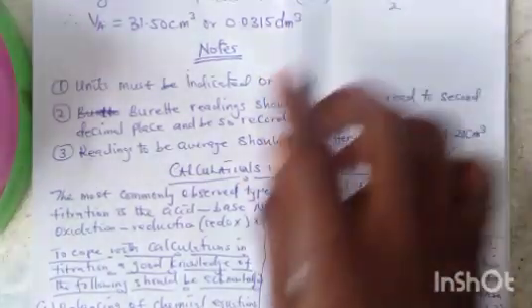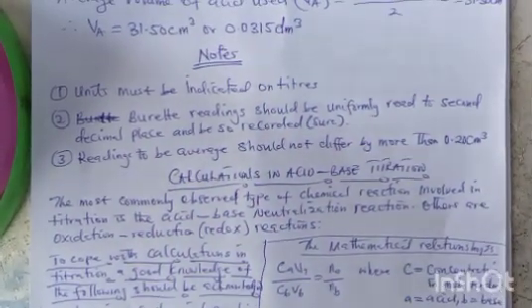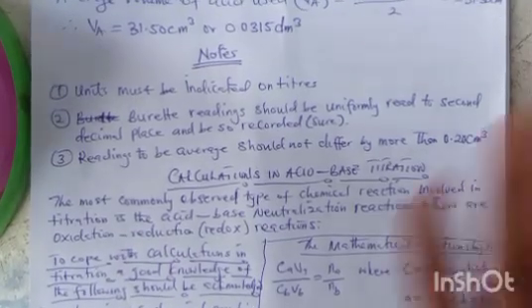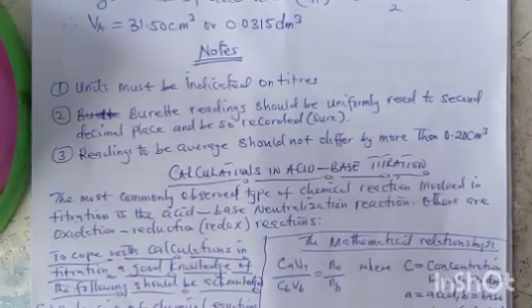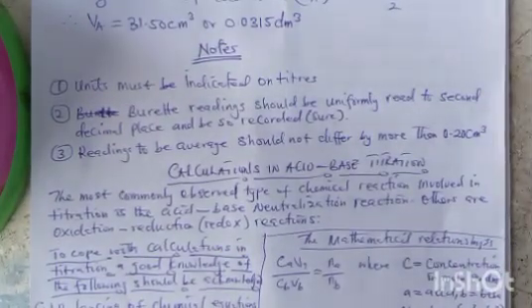So when you watch this reading, everything I'm doing is to two decimal places. You can extend, but two decimal places is the uniformity that is normally recognized.